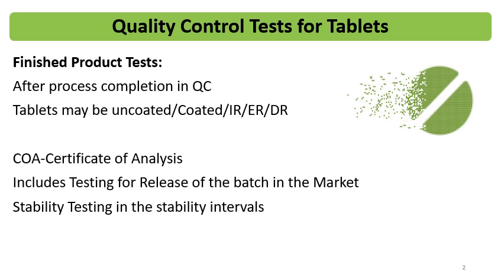The tablet formulation may be coated, uncoated, and may be IR, ER, or delayed release. So these tests are common for the formulations. Mainly, the disintegration test is not performed on the extended release, sustained release or modified release formulations, but it is performed for the IR and DR formulations.